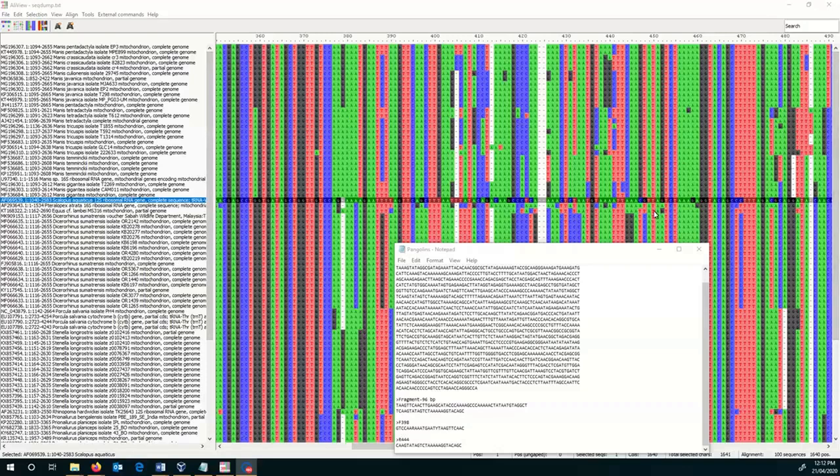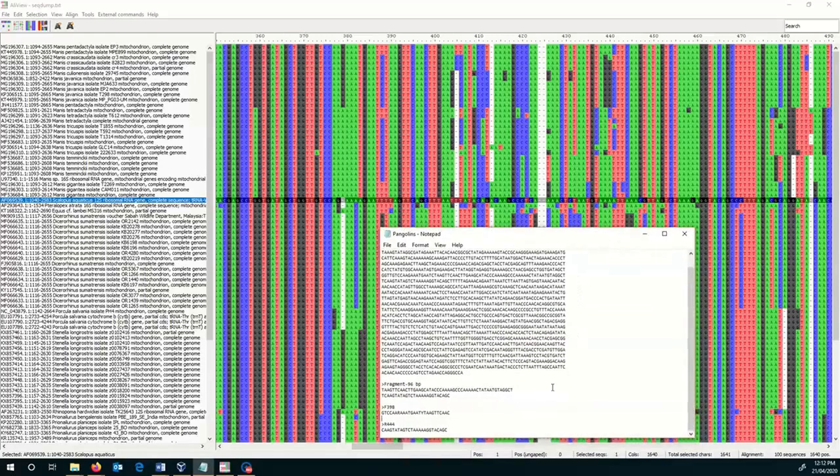Okay, as you can tell, I'm completely winging this. I actually didn't plan to look for pangolins or anything until 10 minutes before I did this talk. But anyway, there is a region that's useful for us.